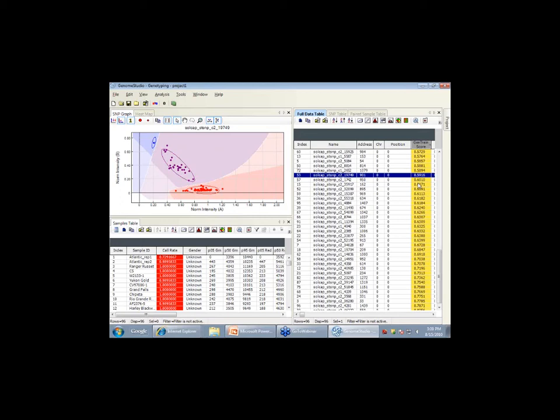If you have a C/G SNP that you're assaying, that's all it's going to assay. If that sequence doesn't exist in your wild species, it's obviously not going to show up on either the C or the G. But from what we've seen, the SNPs that we've checked have been pretty useful across the diploid species that we've tested, and for the vast majority of the markers, actually.